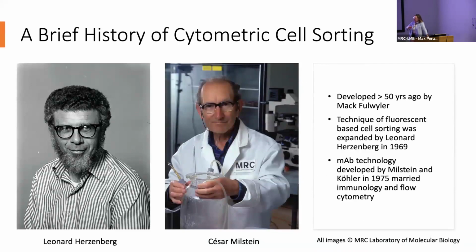After Mac had developed that first prototype, it didn't contain any lasers. And Leonard Herzenberg, this is a picture of him while he was a visiting postdoc here at the LMB. He was a geneticist at Stanford, and he immediately recognized that there was this potential to use this technology, and was interested in adding a light source so that he could sort any kind of fluorescently labeled cells for even more specific fractionation of certain subsets.